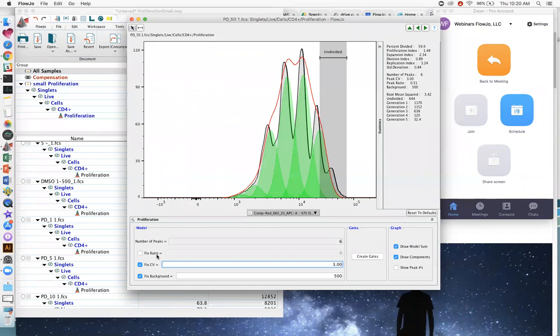That is a set of cells where you've removed the doublets, you've removed the dead cells, and you have essentially cells of a uniform size. Every time the cells divide, they should give approximately half of the dye to the following generation, so each of the 2 daughter cells gets half of the dye that the parental cell had.